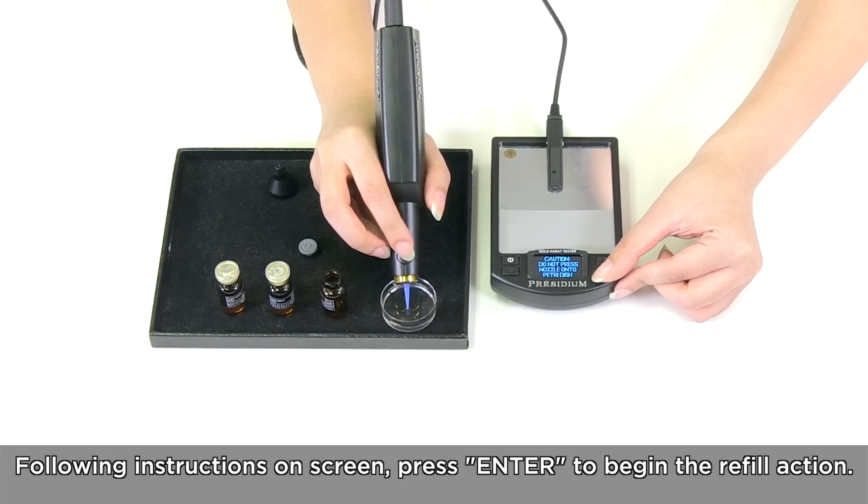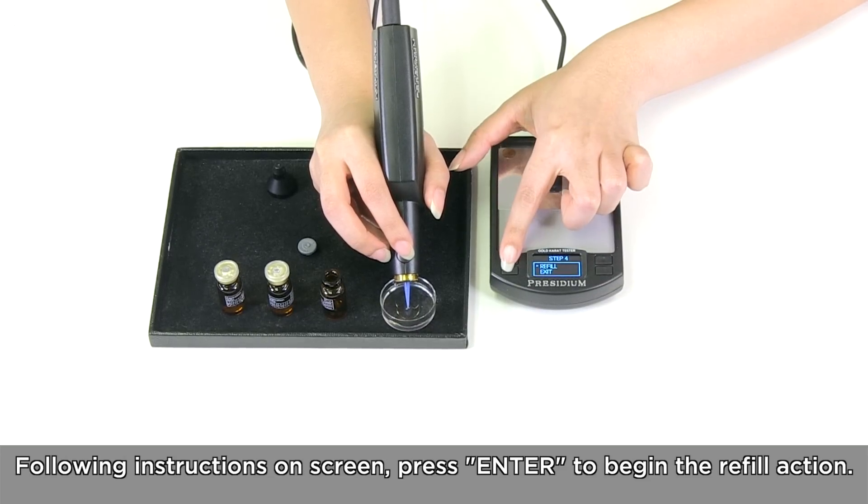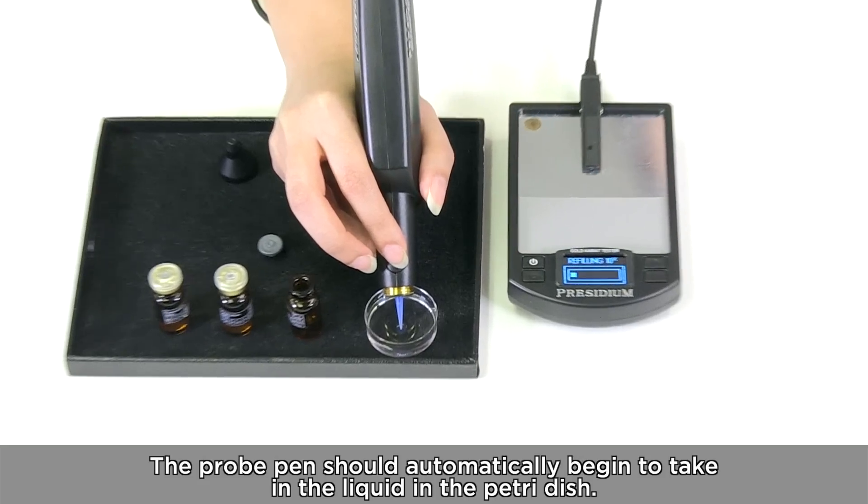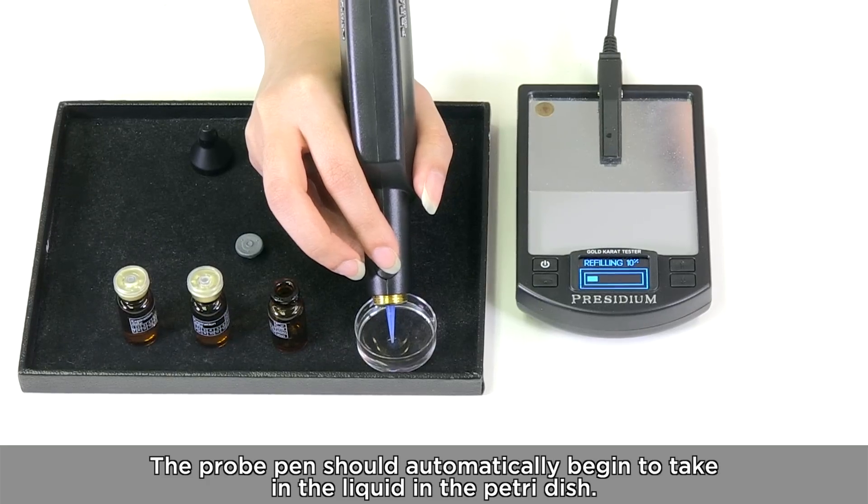Following the instructions on screen, press Enter to begin the refill action. The probe pen should automatically begin to take in the liquid in the Petri dish.